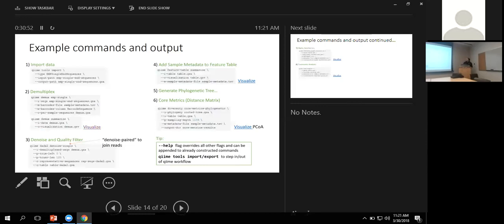So here you see there's just some summary statistics regarding the demultiplex data. There is a visual representation of the number of samples with each amount of sequences here. And then you can see each sequence listed with the sequence count in descending order at the bottom.